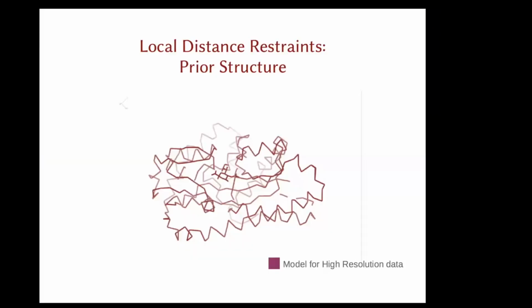Right, as I said, the major place where the threading is apparent is in the real space refinement, and in particular the real space refinement into low resolution maps, or using low resolution information to do large scale motions. So let me introduce the concept of Geman-McClure restraints. I use them synonymously with local distance restraints.